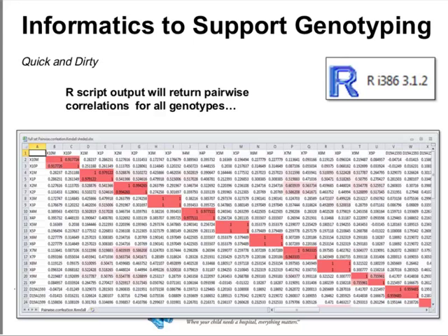So I want to emphasize that this visualization is not to make a determination on whether or not something is a mismatch or not. It is simply a way to visualize the data that allows you to quickly hone in on issues. Obviously, if you have a perfect match or a near perfect match in the genotype between any two samples, you have high confidence that they are from the same individual. But where that actual line of mismatch is in this format is not well defined. It's just a way to highlight samples that you should go back and look at a lot more closely.